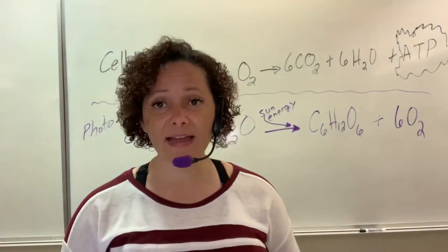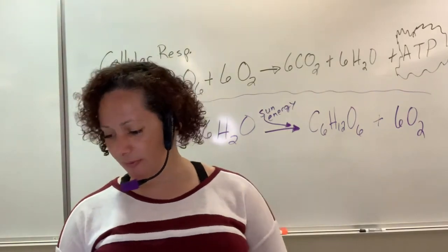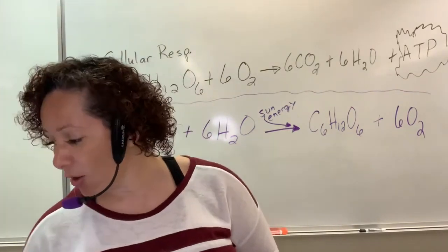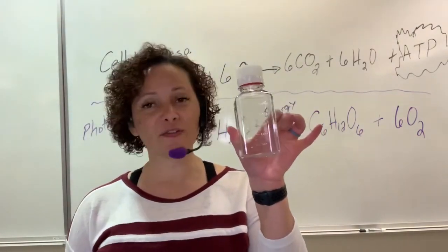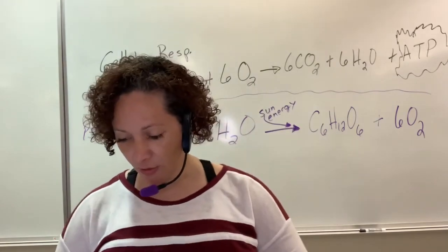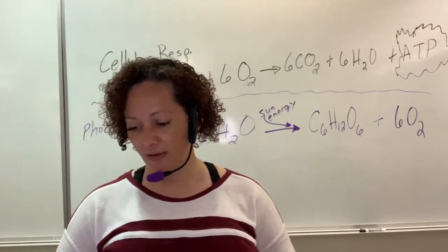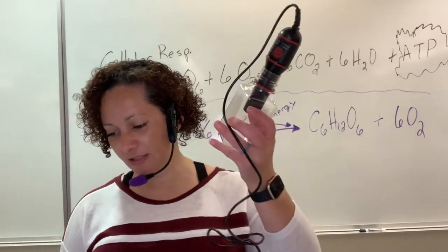Now we need to go ahead and, the probe should, hang on, where am I? Oh, we have this thing called our respiration chamber. I'm just following your instructions here. This respiration chamber, you're going to put the CO2 monitor in the respiration chamber, just like such.